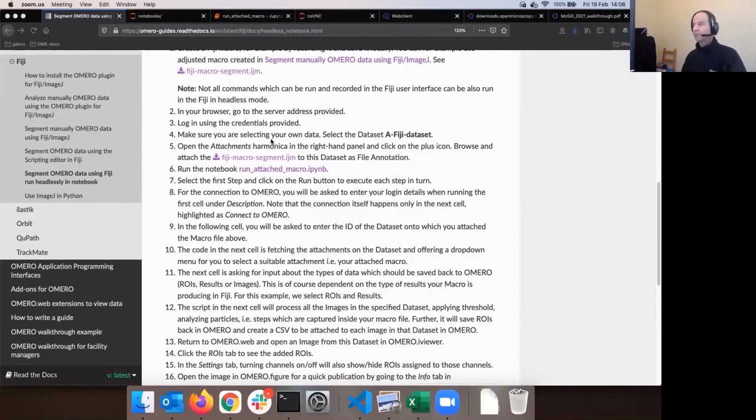Thank you very much, McGill. Let me welcome you to the second part of this Omero workshop at the Advanced Imaging Facility in McGill University. First, let's go quickly over what we want to cover today.